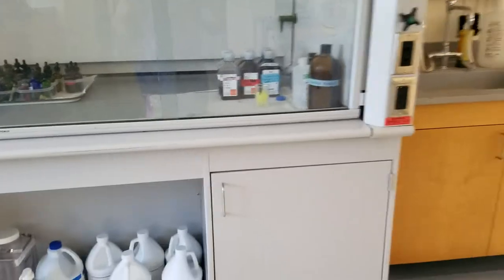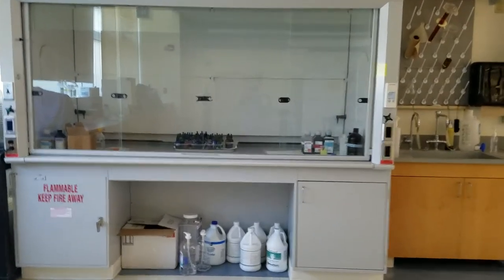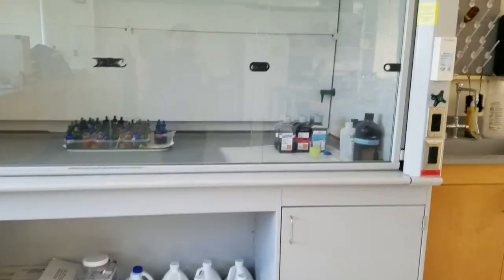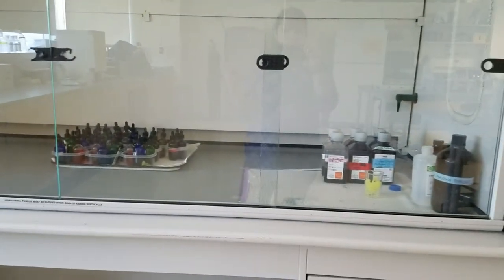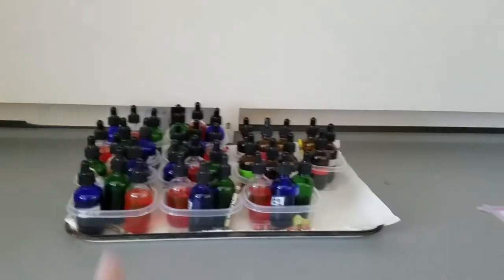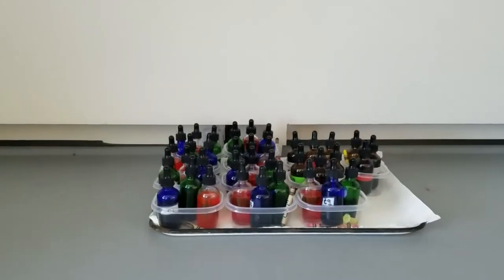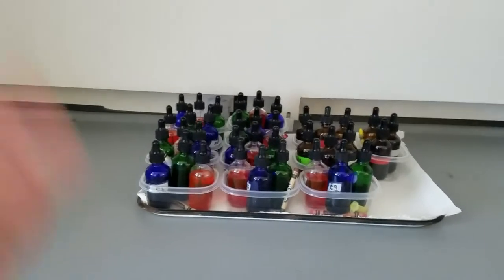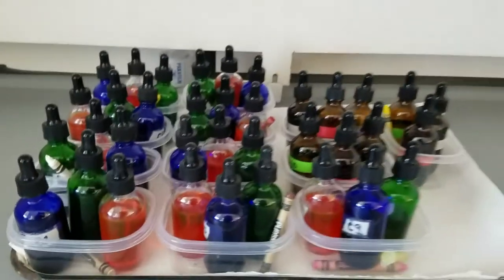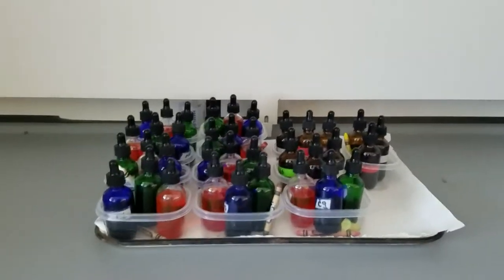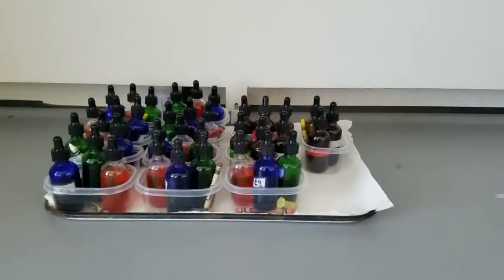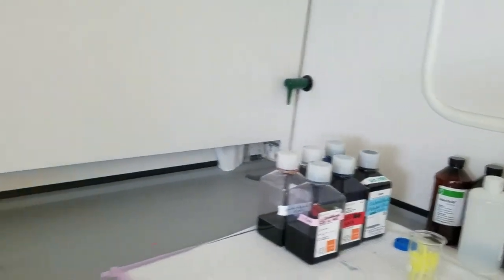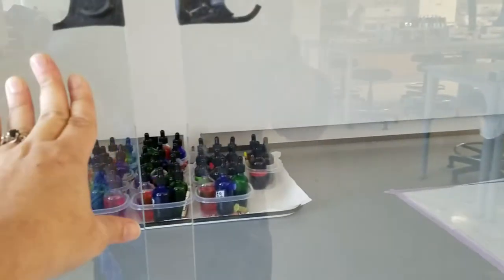Next we have over here our fume hood. This is used to keep any chemical that can have fumes that can be harmful for us. Anytime we need to work with them we will work behind this glass in the fume hood, so all those fumes are getting sucked up there and are not getting into us, affecting us. I have some stains in here that we use to stain cells anytime we want to observe them under the microscope in a better manner. When we're using it we don't want to put our head inside because obviously then you're going to be taking in the fumes.